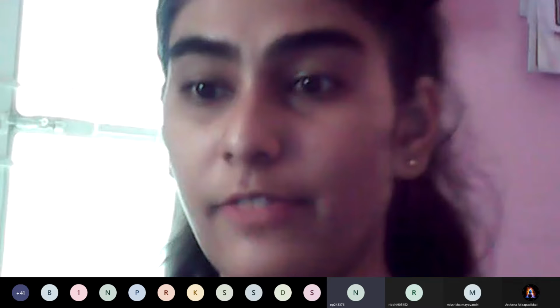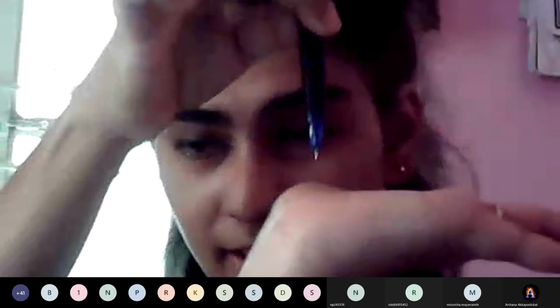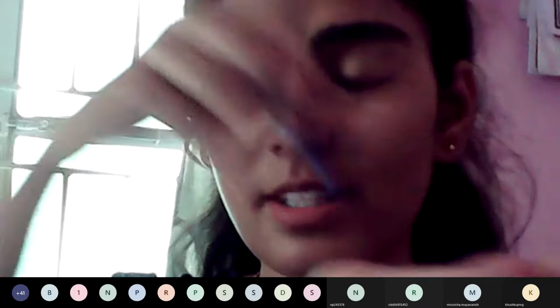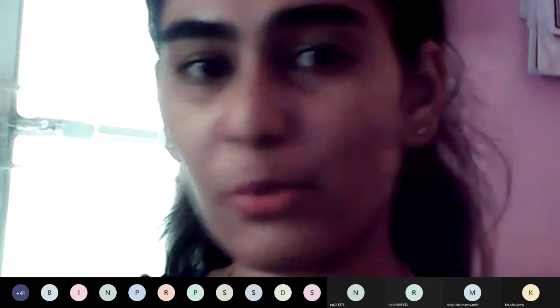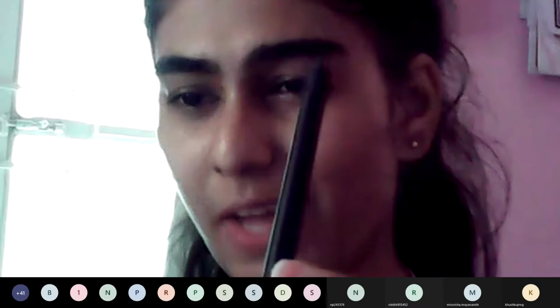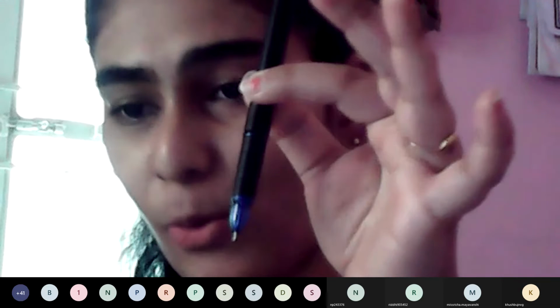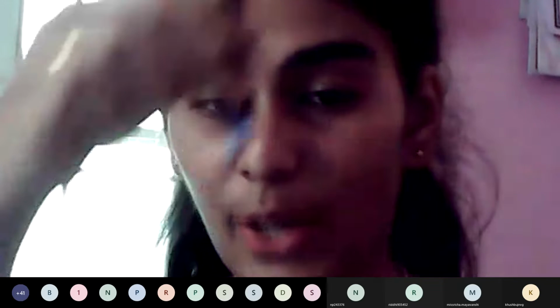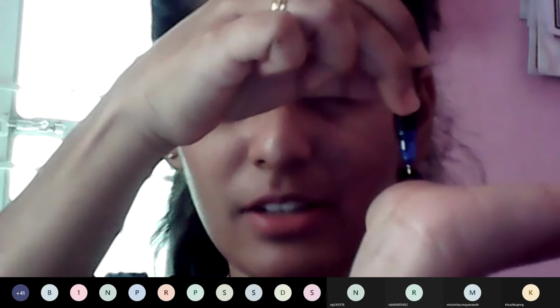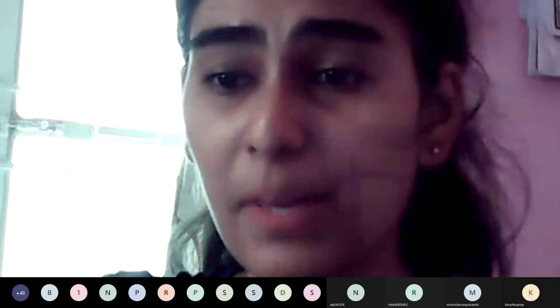Okay, fine. See, suppose this is my capillary, so I just have to simply touch it and take it. Otherwise what happens is, the way we keep our capillary, just think that this is a capillary tube and we have a very small opening of this capillary tube. Now we'll place a spot over here, but we have to make sure that we are keeping a very small spot.